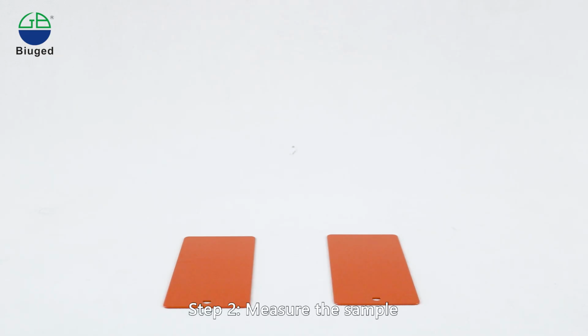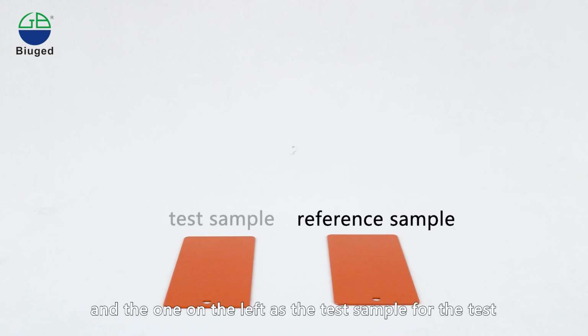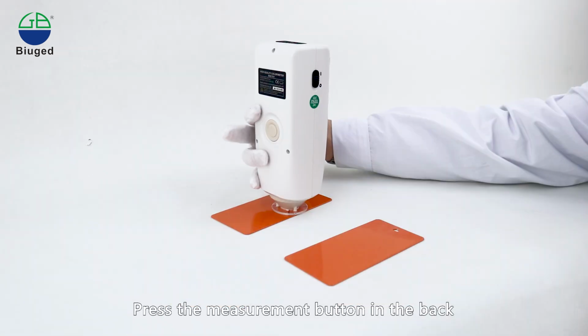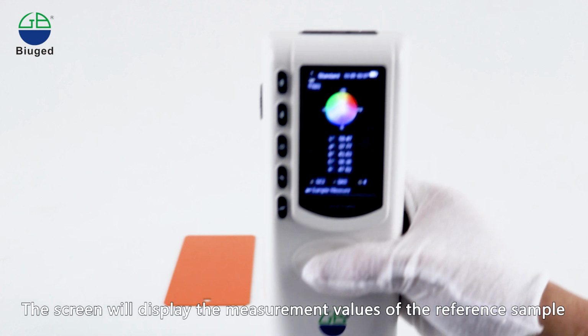Step 2. Measure the sample. Use the sample on the right as the reference sample, and the one on the left as the test sample for the test. Place the instrument on the reference sample. Press the measurement button in the back. The screen will display the measurement values of the reference sample.